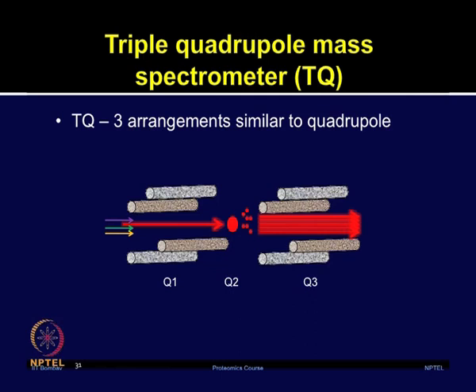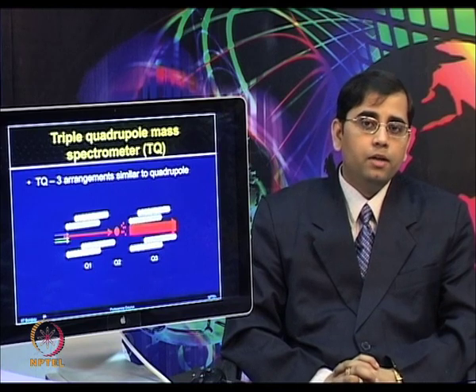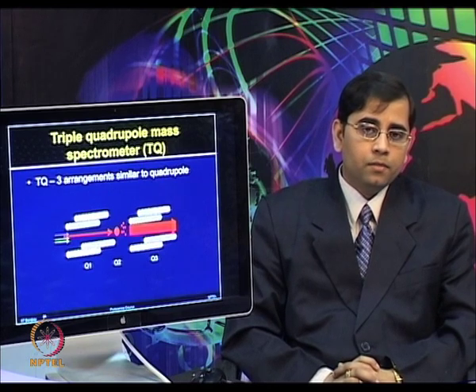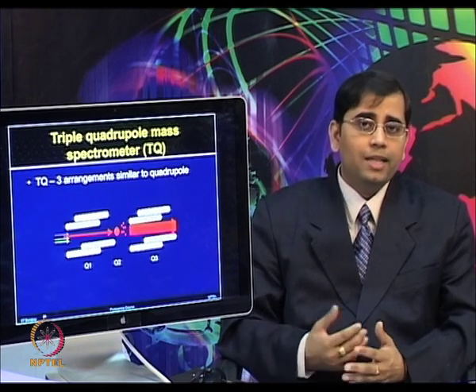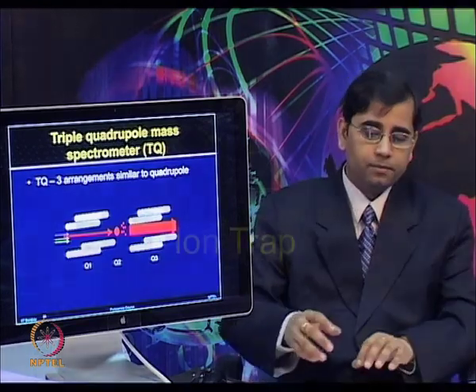Q3 scans the stream of ion fragments which are emerging from the collision cell to generate a collision induced dissociation spectrum, the mass spectrum of fragments derived from one peptide. After one analysis is complete, Q1 directs a different intact peptide into the collision cell. So, in this sequential manner, it can process various peptides.